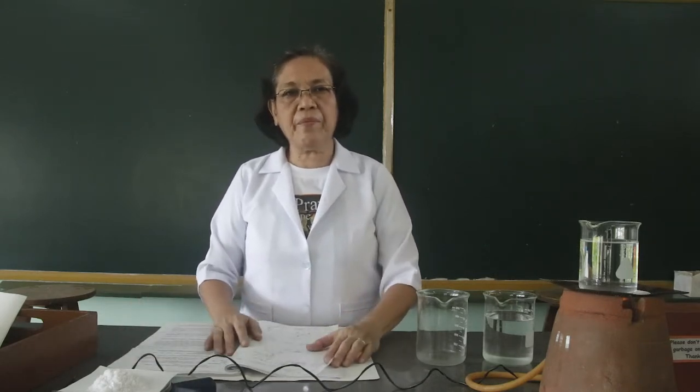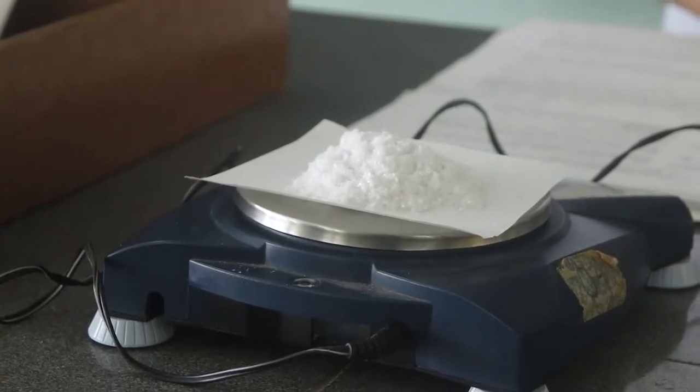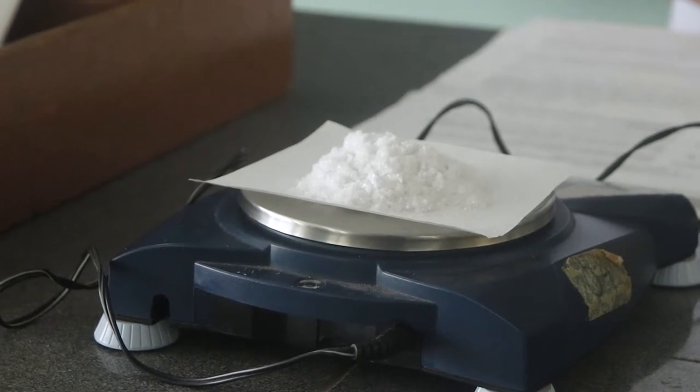The first part of this activity is the recrystallization of the acetanilide. In recrystallizing the acetanilide, we are going to weigh first the crystals of the acetanilide. I have here the acetanilide placed into the top loading balance, but this has to be protected with the filter paper. So I am placing here first the filter paper, weigh it, and the weight of the filter paper is 0.8 grams. Since in the procedure we are asked to weigh 6 grams of the acetanilide, the total weight must be 6.8 grams.